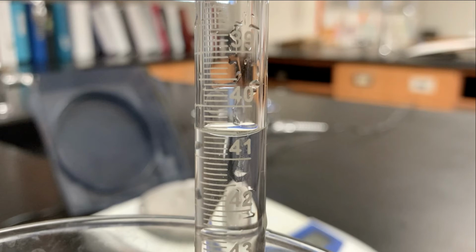One important note is that technically this water level should have been the same water level as was in the beaker, but in order to help you to measure the volume, I lifted it up out of the beaker. So that's going to cause a tiny bit of error in the volume of gas that we measure, but not significant enough that we need to be worried.